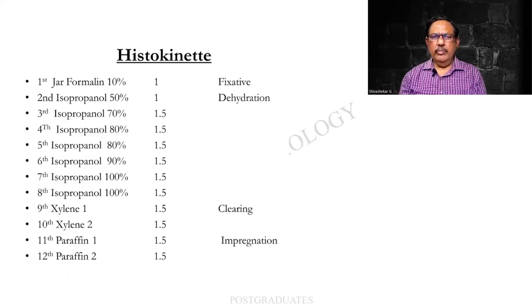This is the classical protocol. It can vary from laboratory to laboratory and also according to the time available. Whatever be the fixation, there is one stage of fixation followed by the ascending grades of alcohol. This is still followed by the clearing and then maybe two or three changes of paraffin. In total, there might be about 12 jars available.